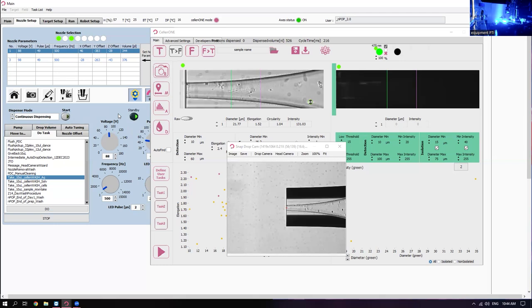Let's say you wanted a cell that was positive for a marker because you edited a cell and you want to know you're knocking one in. You have, let's say, a red RFP, and then you've got your cytox green. You don't want to isolate a single cell that's dead. If the editing efficiency is somewhat low, I would start off with fluorescence looking for a positive red, then a negative green, and then a true single cell condition in transmission. I would make sure only one cell was there in transmission, regardless of whether it was fluorescent or not. It was positive for the marker and negative for being compromised.